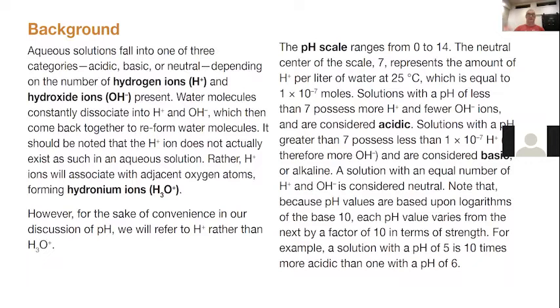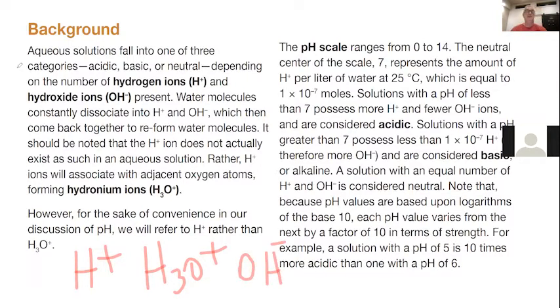So just a little background, we sort of talked about this in class the other night, but what we're going to be doing is titrating protons or hydrogen ions. We can look at them like this, or we can look at them like this. And we're going to be adding hydroxide ions. And we're going to be taking advantage of the fact that when we have H plus and OH minus in solution, they perform a neutralization reaction and form water.